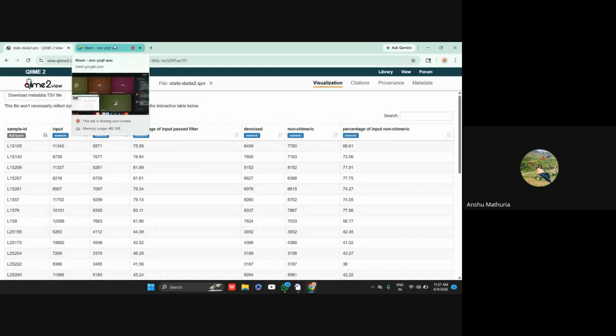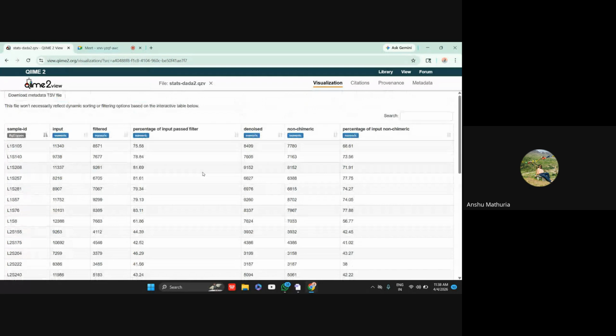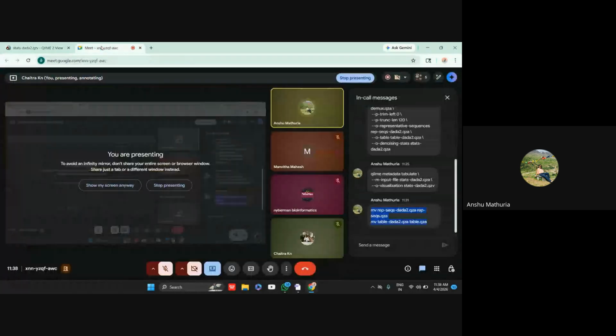Yeah, that's great. You can also see similar outputs, right? So this is what we were expecting. And I hope it's clear how to analyze this output as well. Yes, ma'am. And Manvita, you also share your screen and show me the output once. Yes, ma'am.